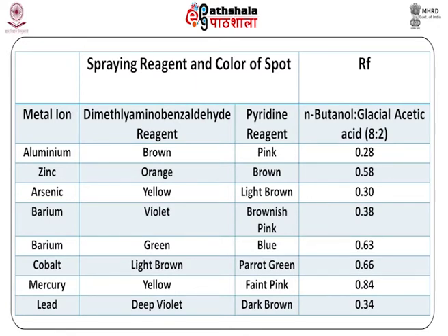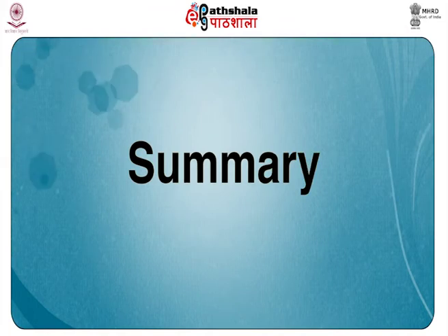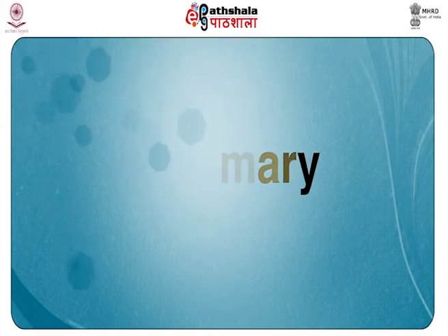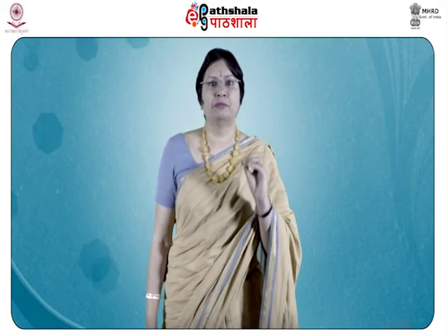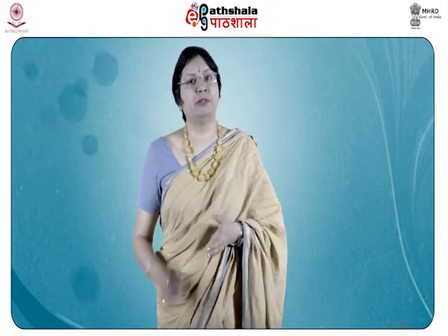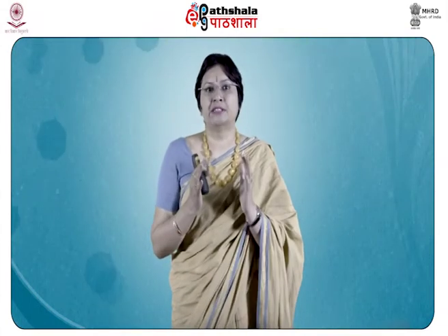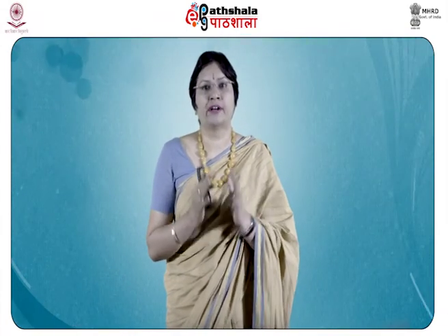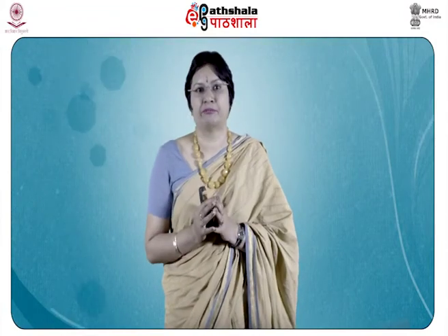So dear students, let us now summarize what we have learned in this module. You have learned that the test for explosives can be carried out very easily by identifying the ions present in them, which may be cation or anion. The test must be carried out along with the reference standard as the blank. This is always something you should keep in mind.